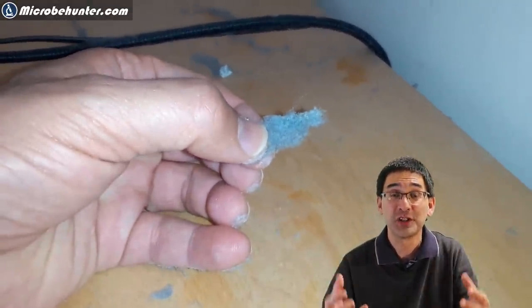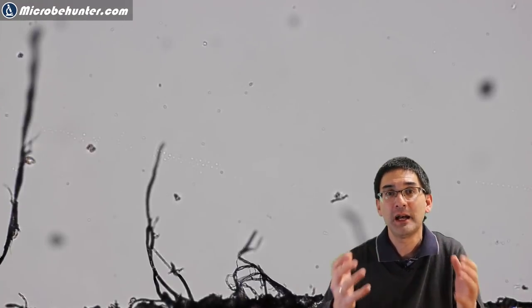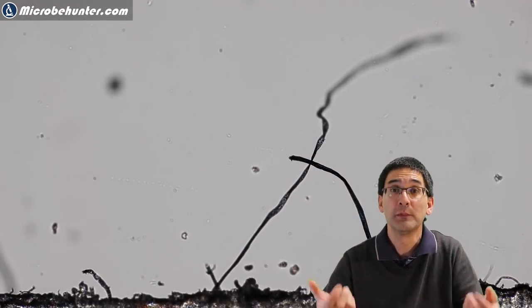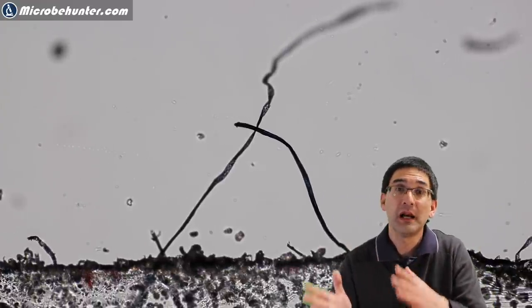As a matter of fact behind my computer monitor I found a lot of house dust and even this house dust is made of many many fibers and they of course are also able to absorb water and therefore they are able to deform and make this movement.